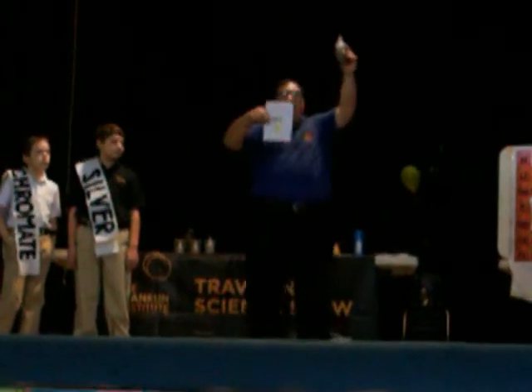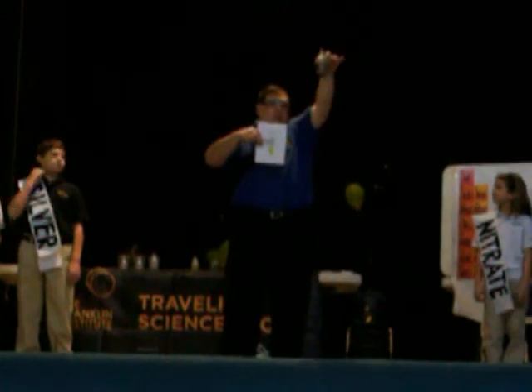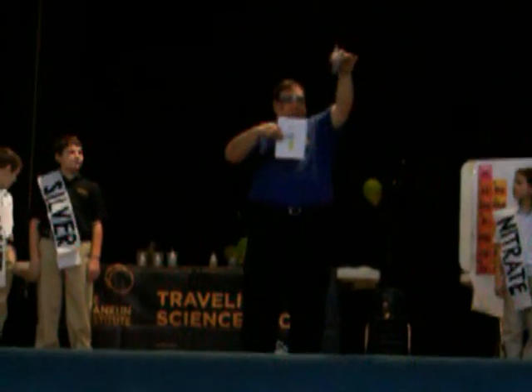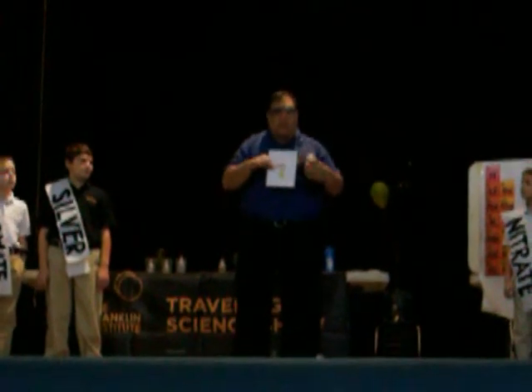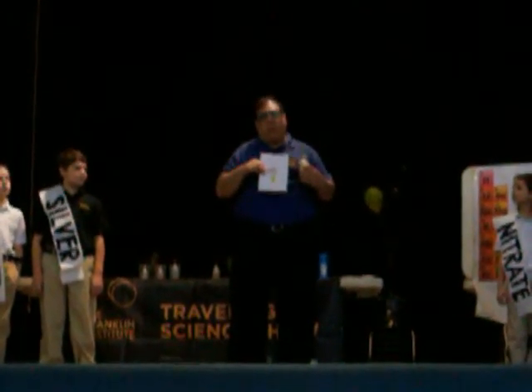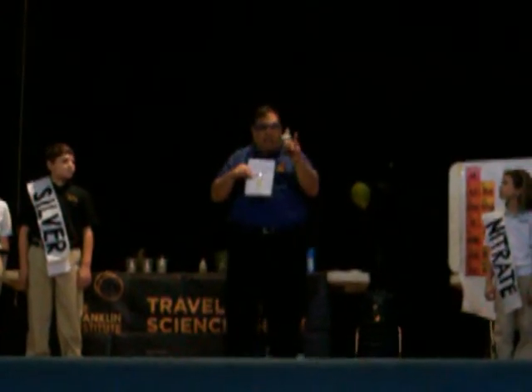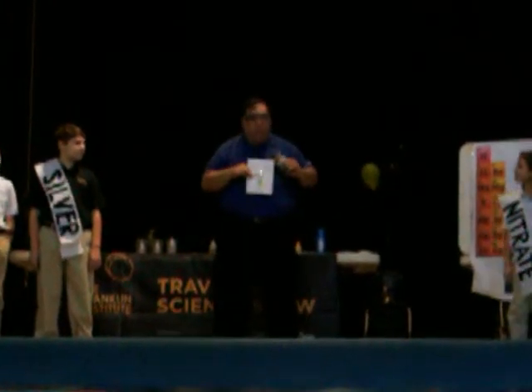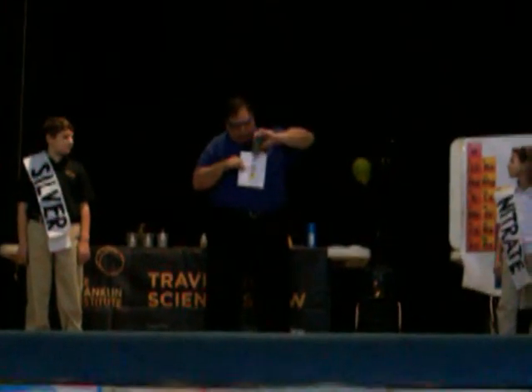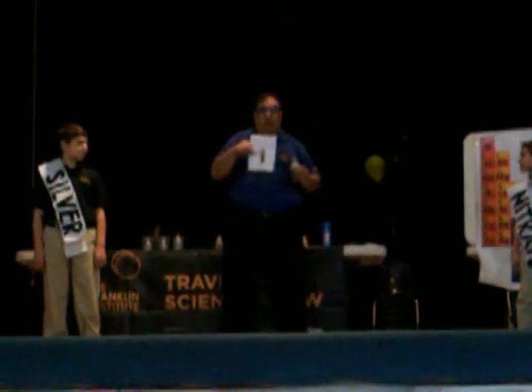I'm now going to add silver nitrate, which is a kind of clear, almost smoky colored liquid. And when I add the clear, smoky colored liquid to the yellow liquid, the potassium chromate, we're going to get our double substitution reaction. And watch how things entirely change. You ready? On the count of three, let me back up here so you guys can see too. 1, 2, 3. Boom. Now you can see that change, right?